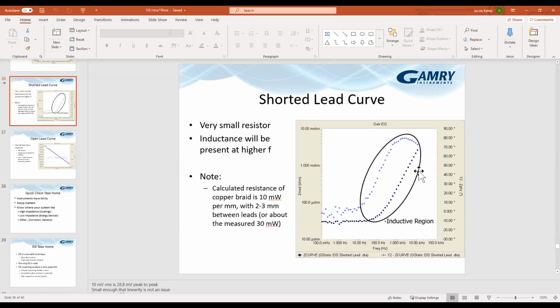There are calculations within Analyst that'll do it for you. We've got an application note that covers it. In general, I know that people submit publications, and a lot of times the response you get back is you need to convert this into a capacitance. That's actually generally bad practice, because the constant phase element values are correct. It gives you an alpha, it gives you the Y value for the constant phase element, and those are correct. The second that you convert that into a capacitance number, you have made some assumptions.